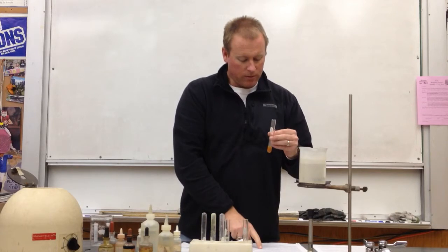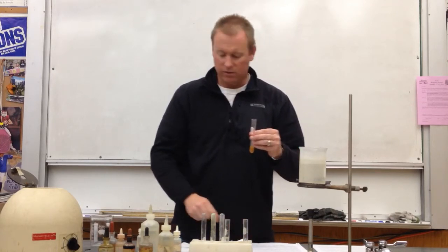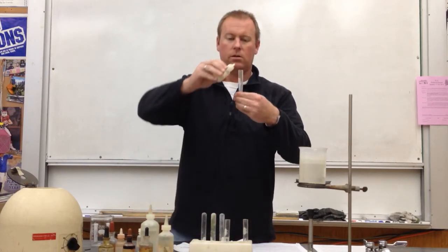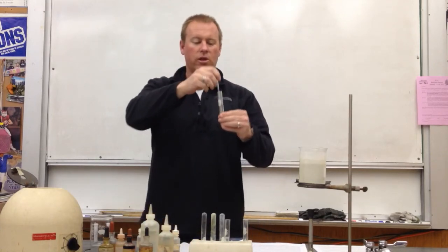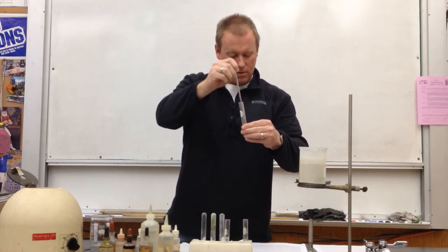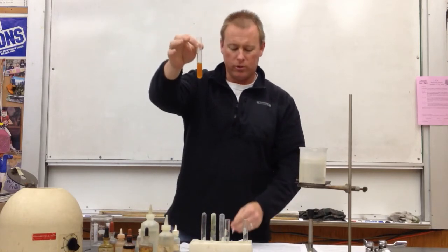If we continue reading, it says to add an additional 2 milliliters of NaOH. So a little less than 2 fingers width. And I can stir that up real well. So what we have now is a rust-colored precipitate.